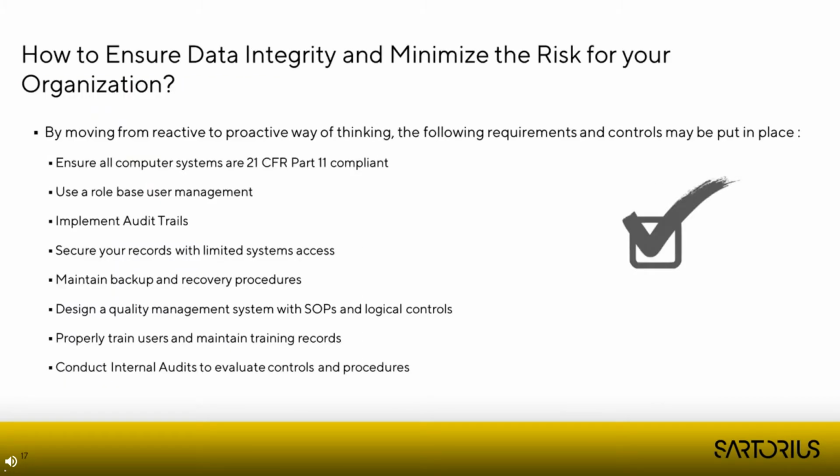I hope these examples have shown you how different the violations can be and how modern laboratory instruments such as the Cubis 2 balance can prevent these issues. The laboratory instrument itself can only support through its functions. The organization itself must always ensure the compliant operation.